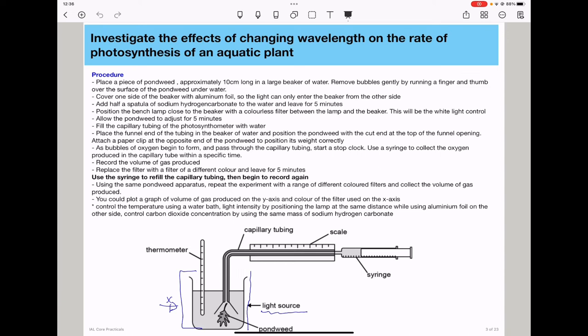So you will keep the same aluminum foil on this side. Then the used light source is going to be positioned at the same distance. We will just be changing the color filters in order to introduce a new wavelength. And finally, we can control carbon dioxide concentration by using the same mass of sodium hydrogen carbonate. You will perform all experiments using the same chosen mass of sodium hydrogen carbonate.